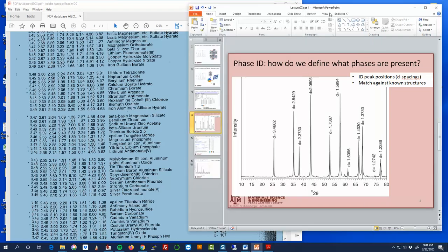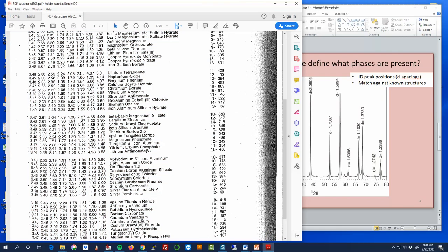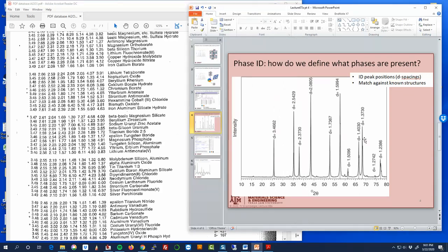Here I find something that could be a good match. The first peak is at 3.48, we measured 3.466, that's pretty close. The second peak is at 2.55, 2.549, that's pretty close. Similarly, 2.38, that's one hundredth of an angstrom off. 2.08, that's spot on. 1.74, 1.60, and from here on out, it's basically icing on the cake. This tells you that this is really among—we know of hundreds of thousands, millions of phases. We didn't know quite that many when this volume was printed, but at least tens of thousands of phases were collected here. Among all of those, this is the only known phase that could be responsible for all of these peaks.